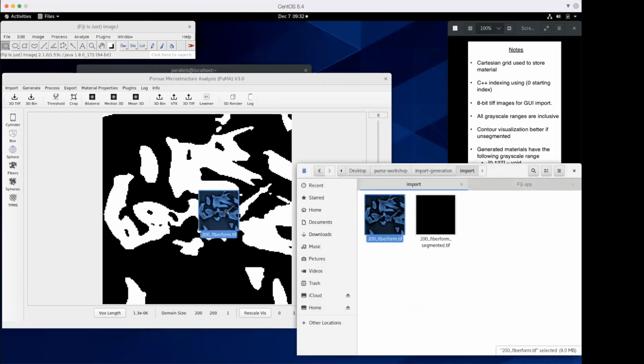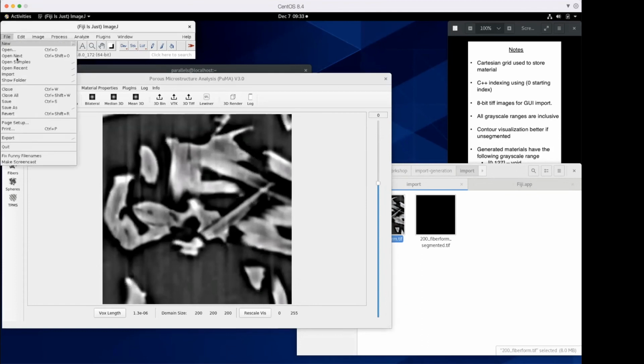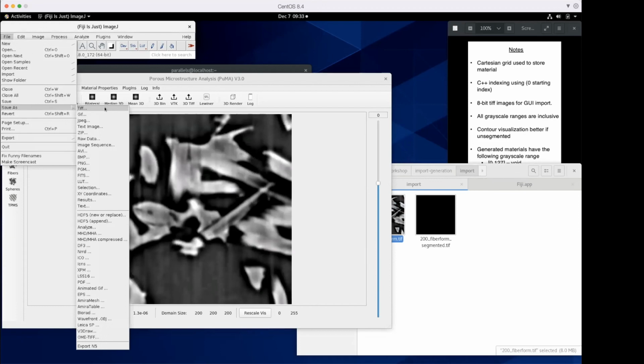Can I just mention one quick thing? Maybe Gerardo saved it from Fiji, and so if you just do command save, for example, if you just do that one control save, then that saves only one slice. So that could be the origin of that. You need to go and do save as and then TIFF. Yeah. Okay, yeah, that's a good point.